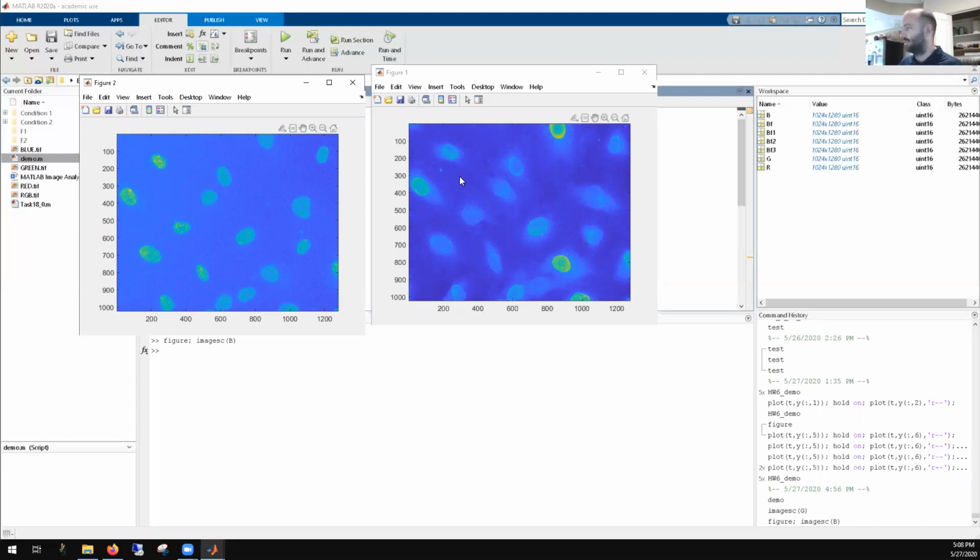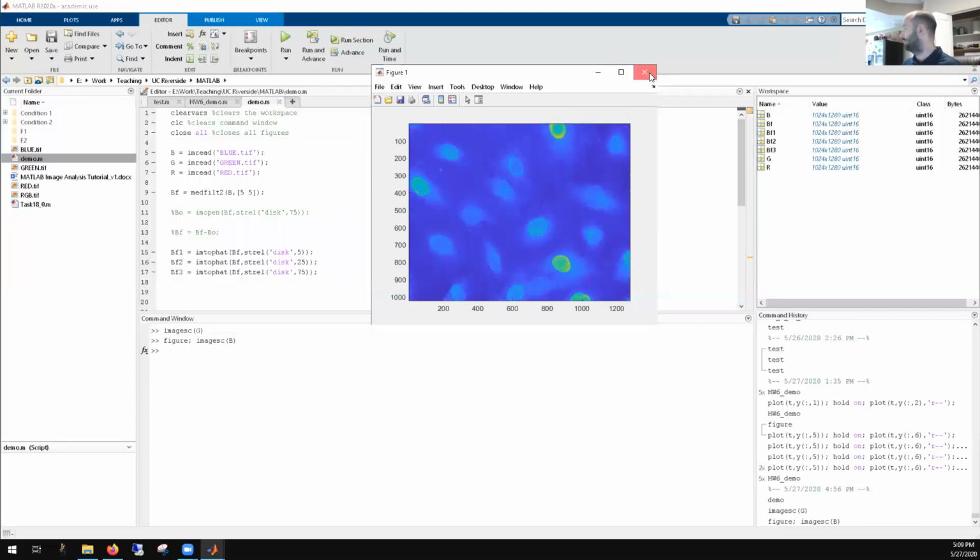And this is the kind of concept that a lot of people seem to have trouble with. We're using this as a marker. We're using the nuclear image, the DAPI image, as a marker so that we can figure out where the nuclei are, and then we're going to quantify off this image. The reason we do this is that segmenting this image is going to be really hard, because this guy's really bright, this one's really dim, and this one barely shows up at all. But if we have a clean nuclear label right here, then we can find the nuclei here, and then we can segment and quantify off of that. So let's go through that process today.